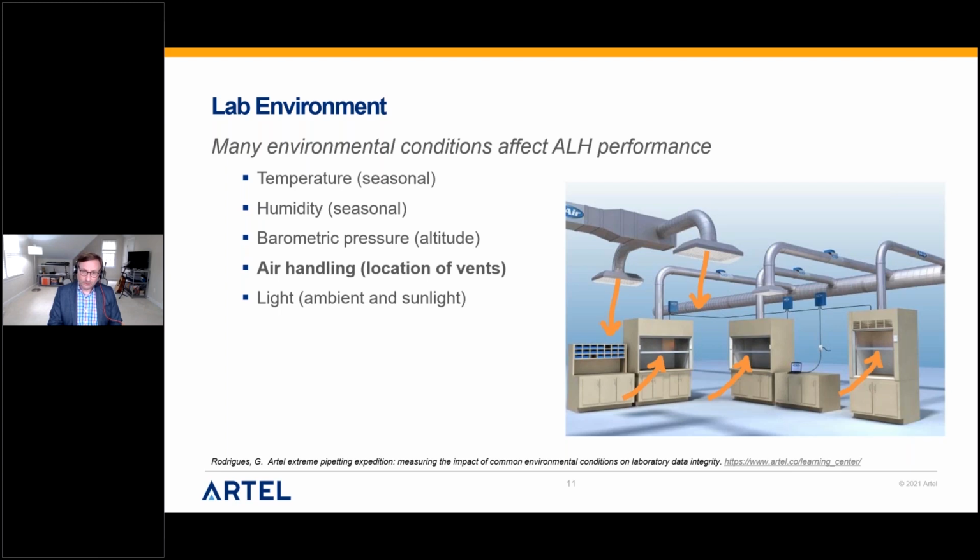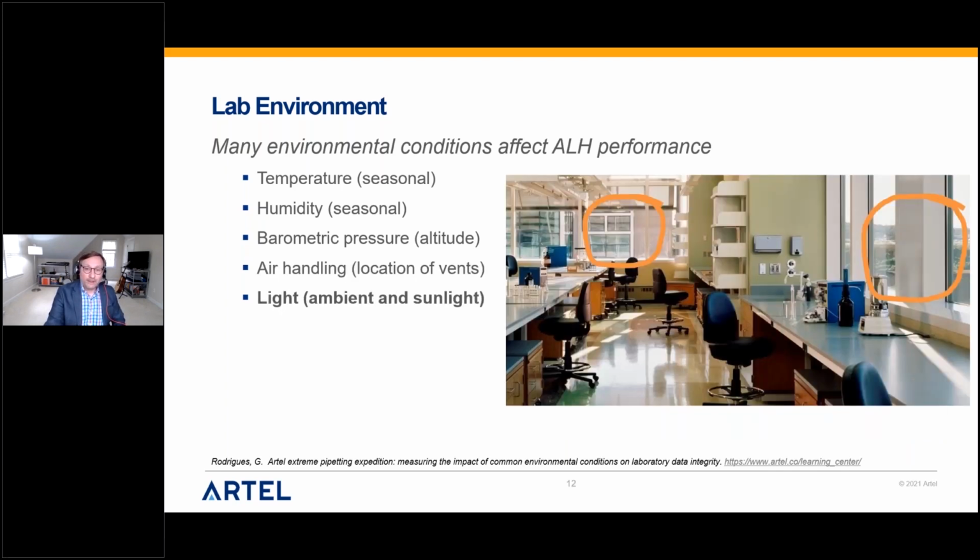I'm not saying that you have to reroute all of your air handling. I'm saying make sure that when you're buying a new liquid handler, you're looking up and looking around to keep this in mind, and then try to adapt appropriately.